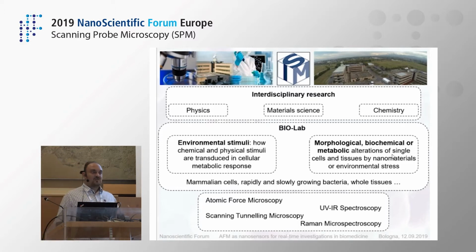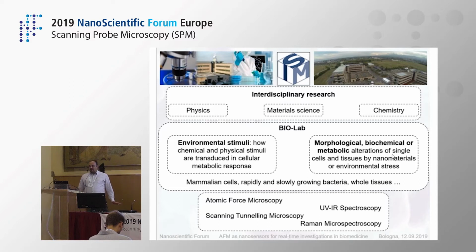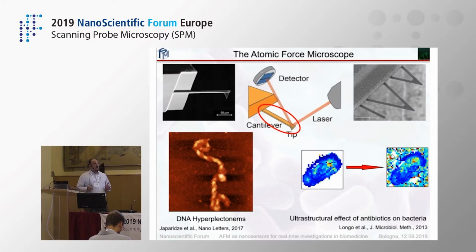In this presentation I will show you how an AFM can be used in a non-conventional way, and then I'll show you some applications of one of the techniques that we developed, the nanomotion sensor. What an AFM is and how the cantilever works, everybody knows in this room. I'm not going to focus on the morphological investigations that can reach very high sensitivity, nor on the nanomechanical investigations, like in this case studying a single bacterium. What I want to do is use an AFM as a movement sensor.